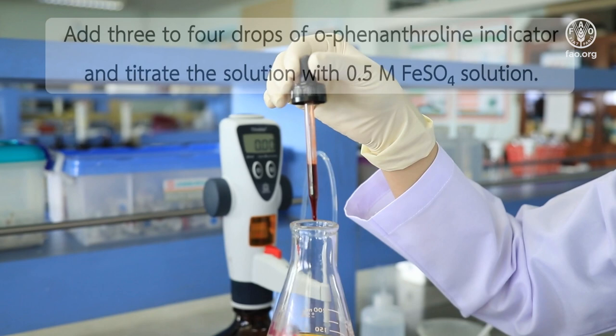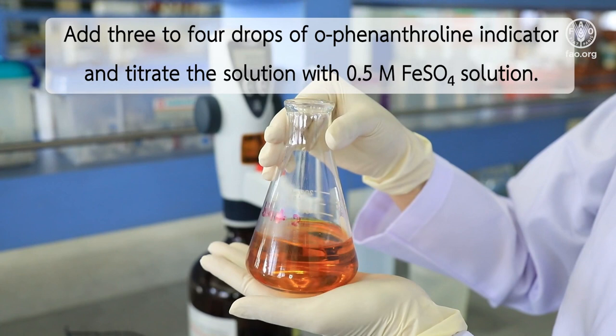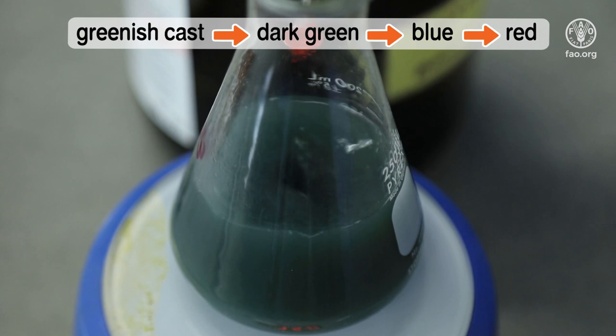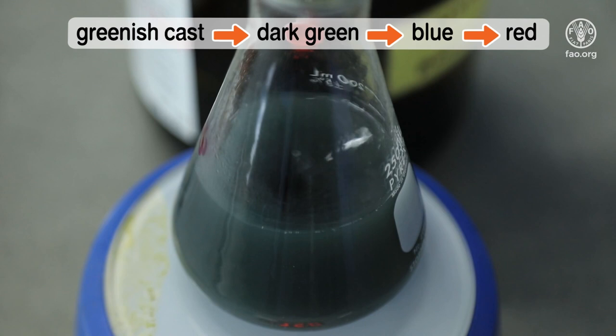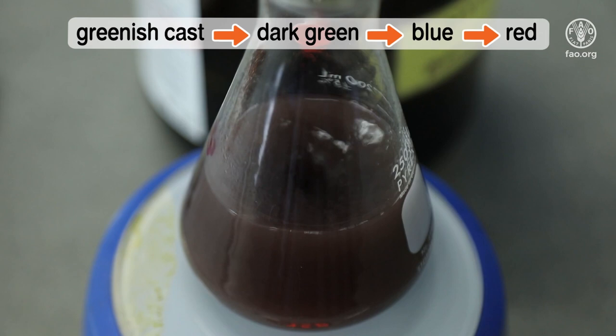Then add 100 ml of water into the flask. If you proceed with the titration by manual method, add 3 to 4 drops of phenanthroline indicator and titrate the solution with 0.5 molar ferrous sulfate solution. As the end point is approached, proceed carefully with the ferrous titration when using phenanthroline indicator. The solution takes on a greenish cast and then changes to a dark green. At this point, add the ferrous sulfate heptahydrate drop by drop until the color changes sharply from blue to red maroon color in reflected light against a white background.